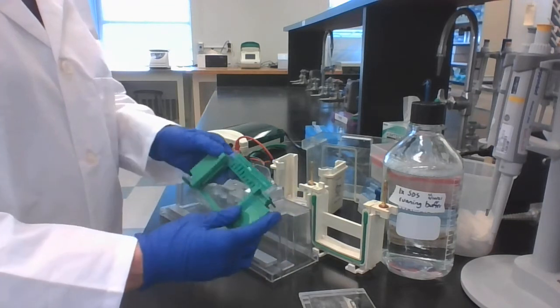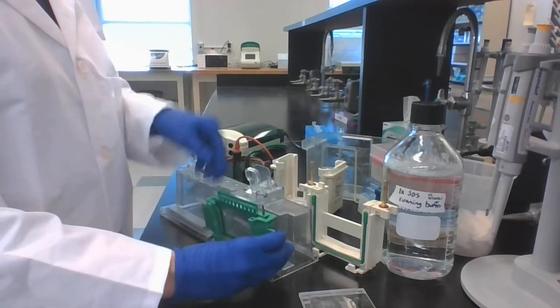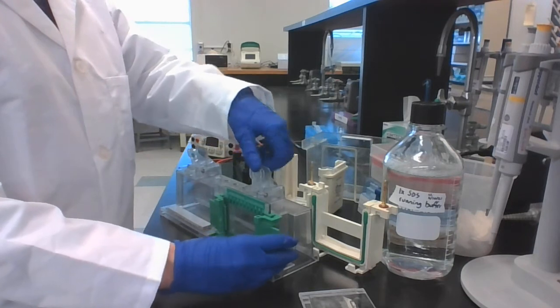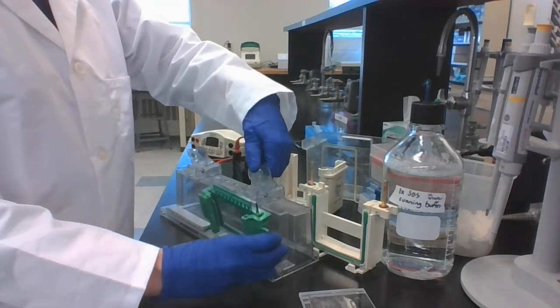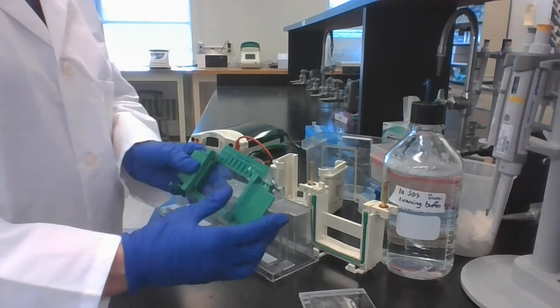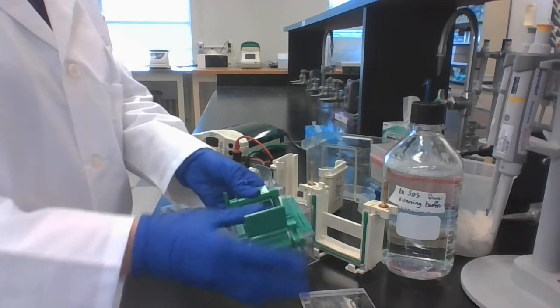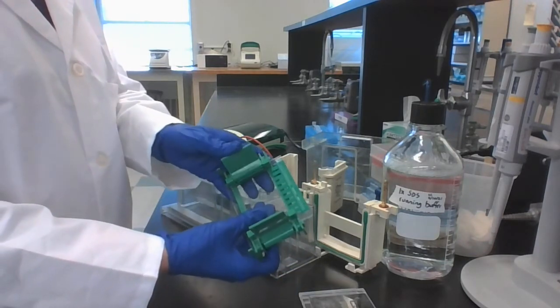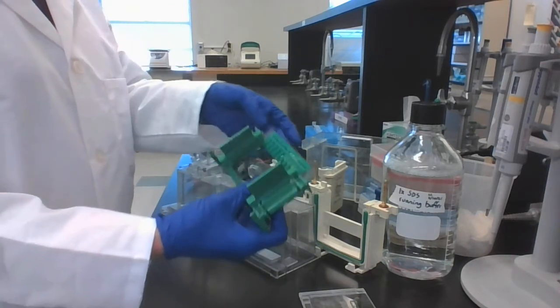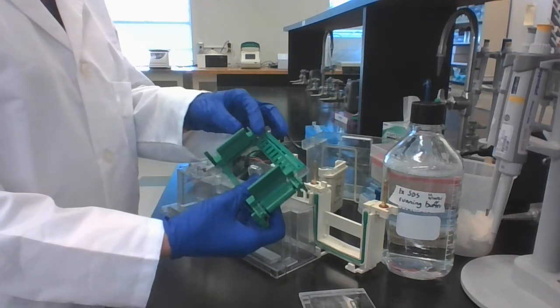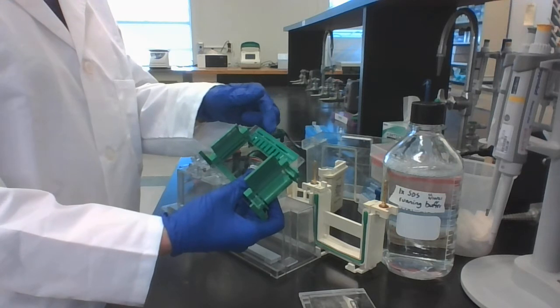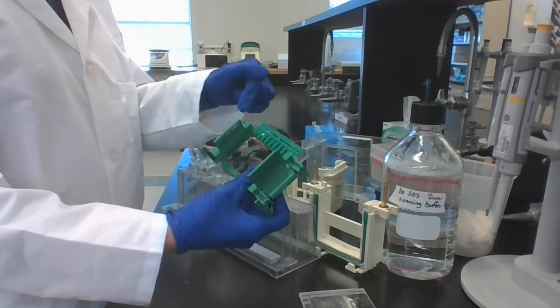Now that we have our completely polymerized gel, you can take it out of this frame, this clamp, by just loosening it and taking it straight out. You also want to take it out of the green frame, so to do that, you open the door. Make sure that you're holding on to it, because once the doors are open, these glass plates can just slide out. Don't let that happen to you.